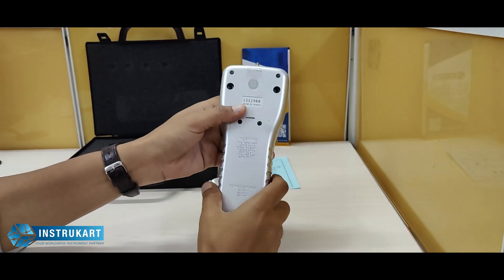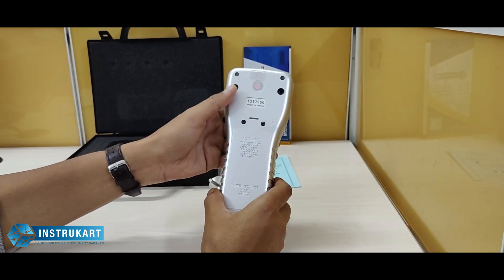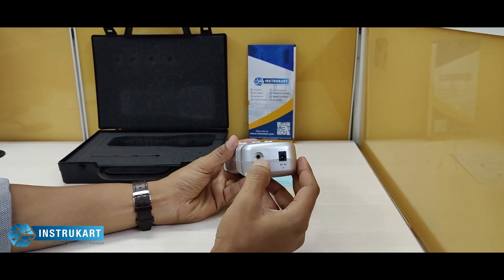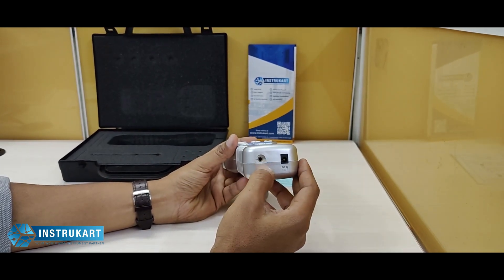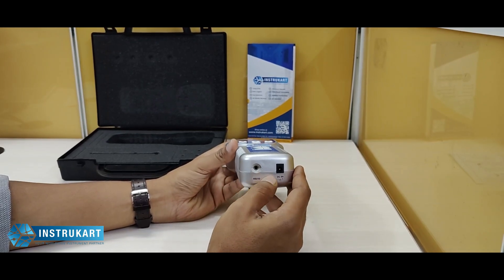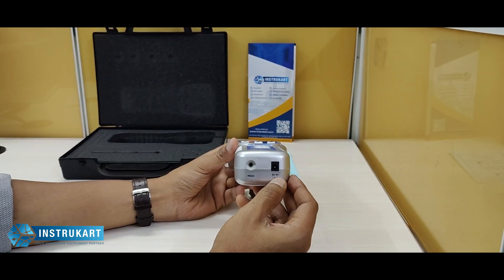This uses a battery at the back — 1.5 volts into six batteries. It also has an RS232 communication interface, which means it can connect to a computer and relay data continuously. In the absence of a battery, it can run with a DC 9-volt adapter.